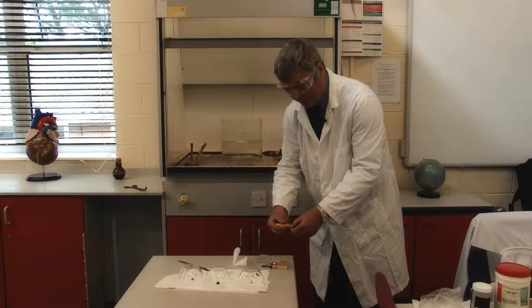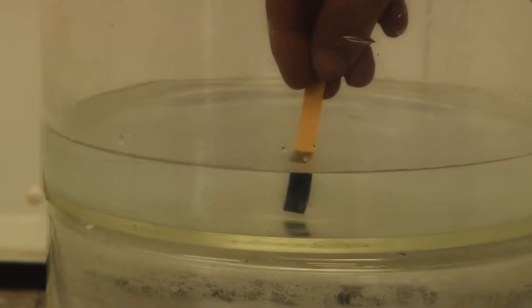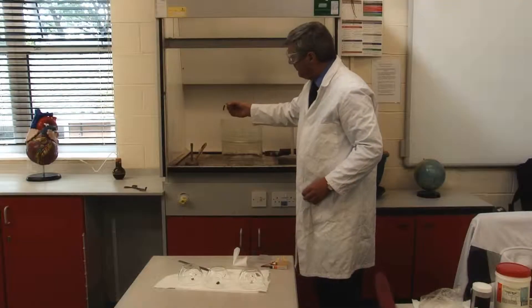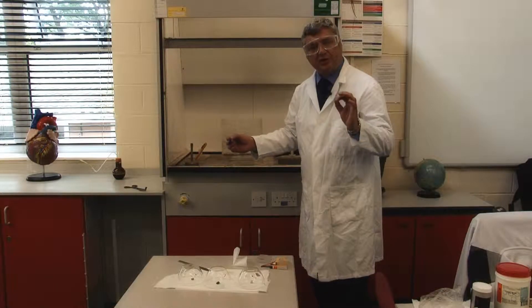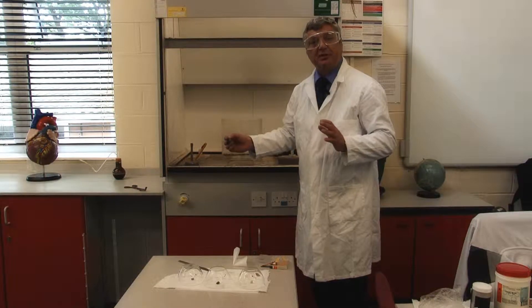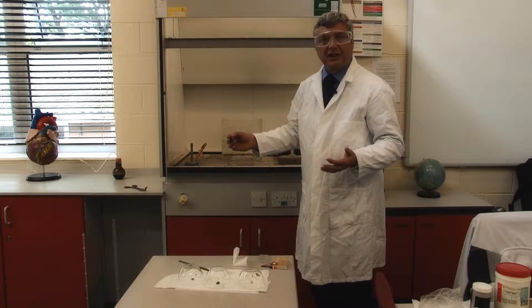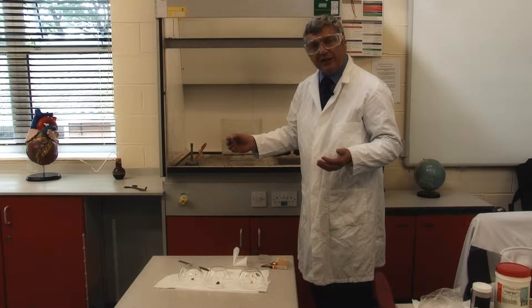Again we can demonstrate that the water is extremely alkaline from just a small piece. As before, this means the water is caustic and can cause chemical burns, so it must be treated carefully.